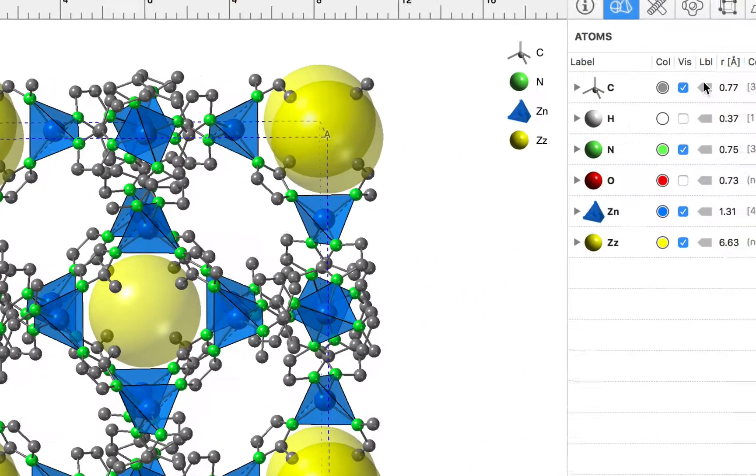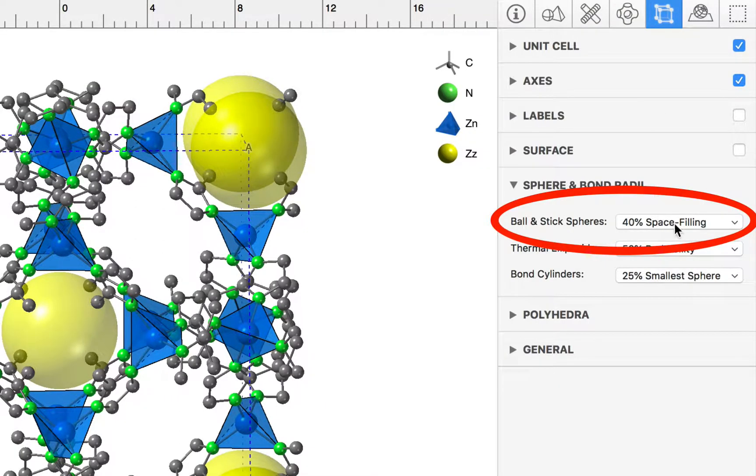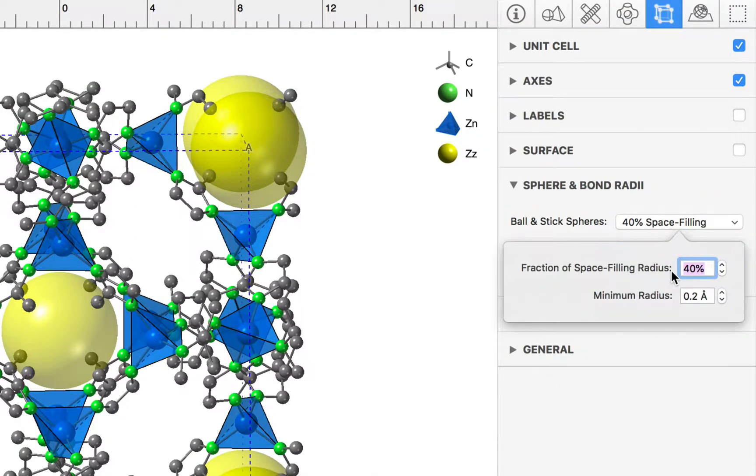If we go to CrystalMaker's model inspector, you'll see that ball-and-stick spheres are plotted at 40% of their space-filling radii.